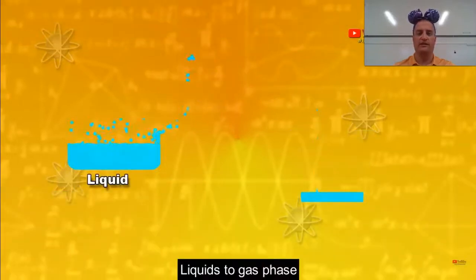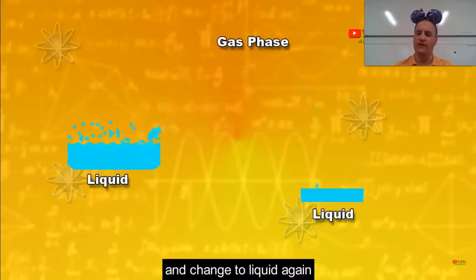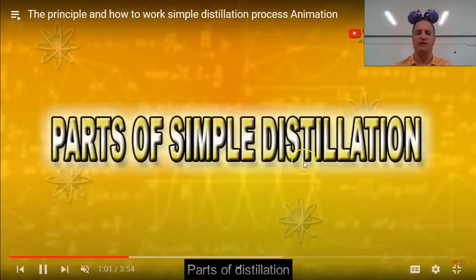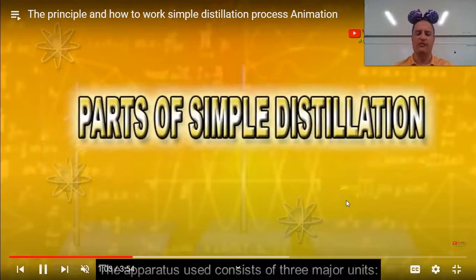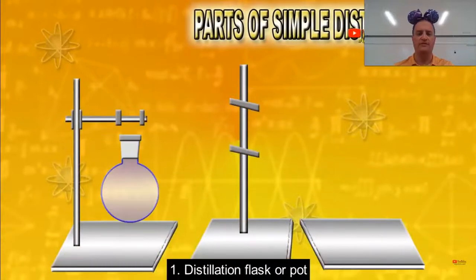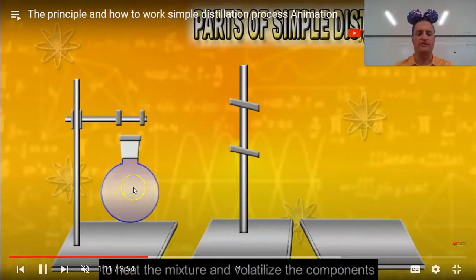Unlike the column chromatography, that didn't change phases. That was always in a liquid phase. This is changing it to a gas, which could have some components that could be difficult if things start to break down at lower temperatures. But generally, you wouldn't use this as a part of that. So there's three major components that you have from this. Distillation flask, what you're going to be putting your mixture in.